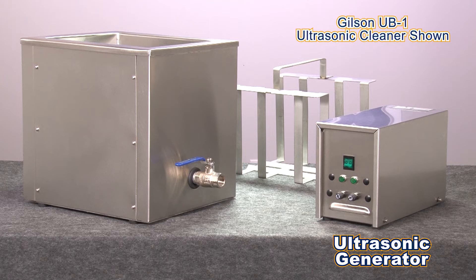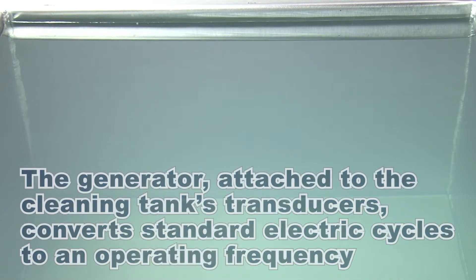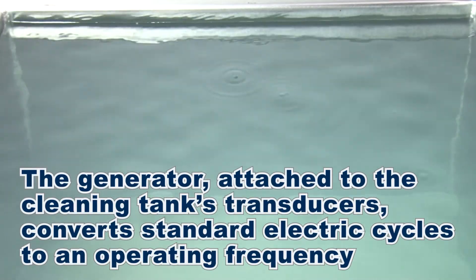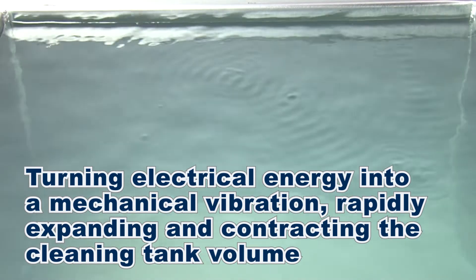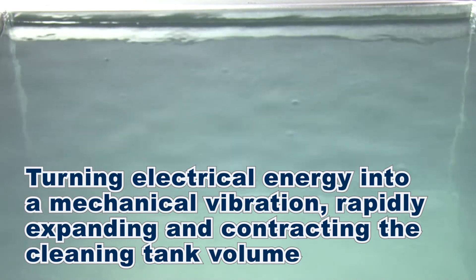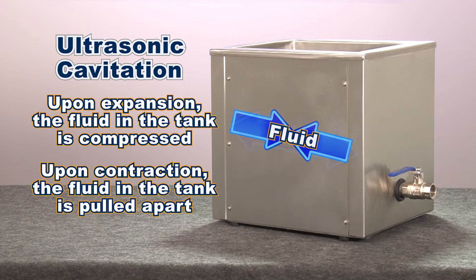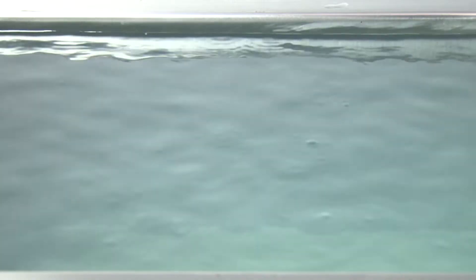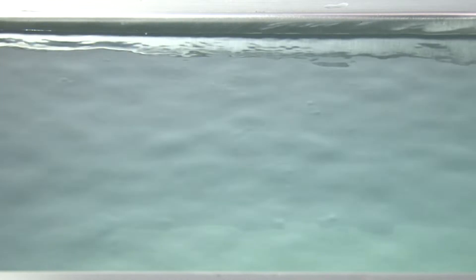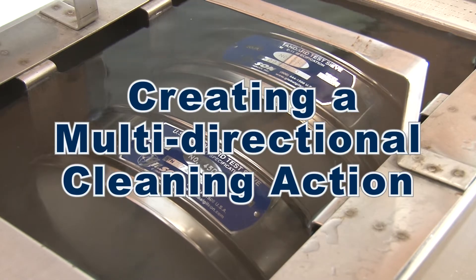An ultrasonic generator attached to the transducers converts standard electric cycles to the required operating frequency. When in operation, the unit turns electrical energy into mechanical vibration, thereby rapidly expanding and contracting the cleaning tank volume. Upon expansion, the fluid in the tank is compressed; then upon contraction, the fluid within the tank is pulled apart. These microsecond changes essentially lightly scour the whole mesh surface.